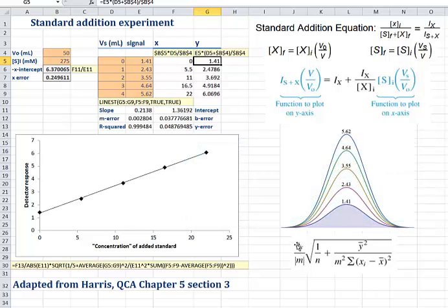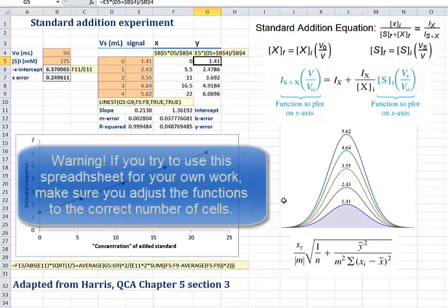Notice how it needs the standard error in y, which we got from our LINEST, the slope that we got from our LINEST, and the number of points, in this case 1, 2, 3, 4, 5.